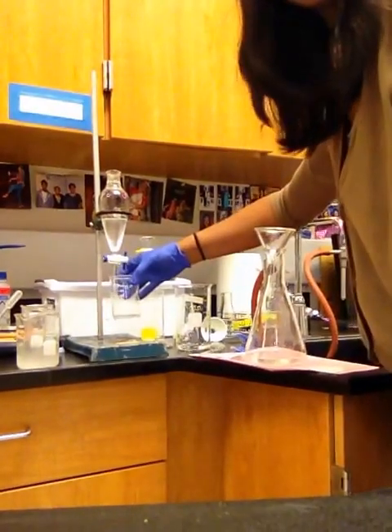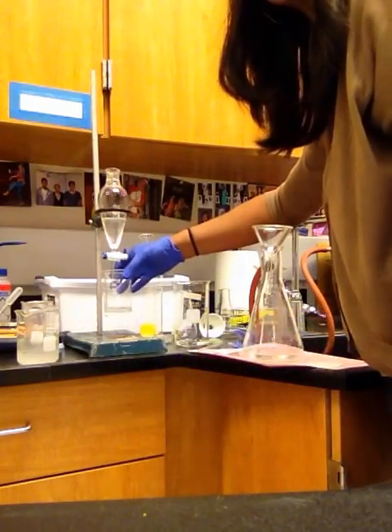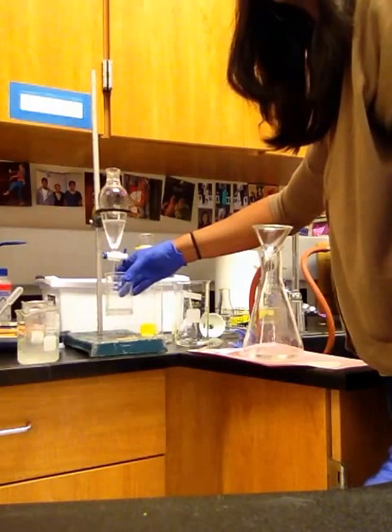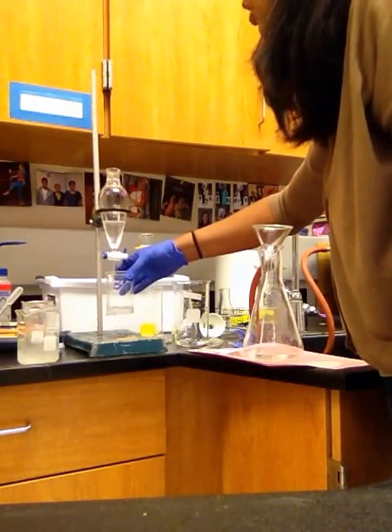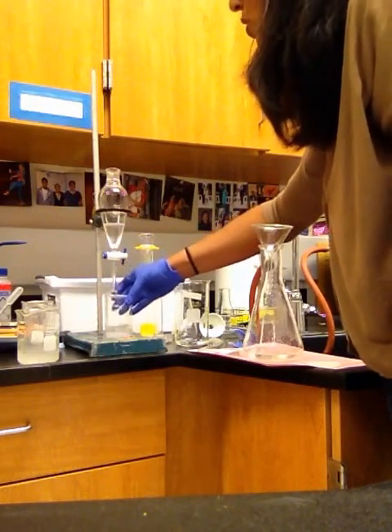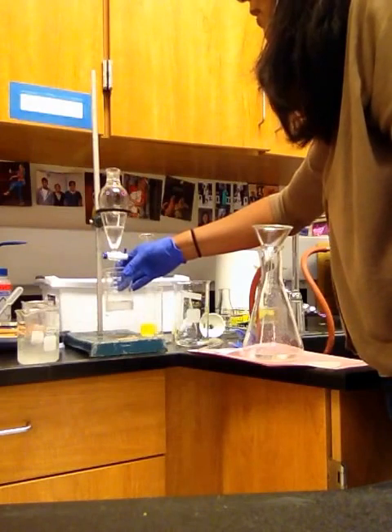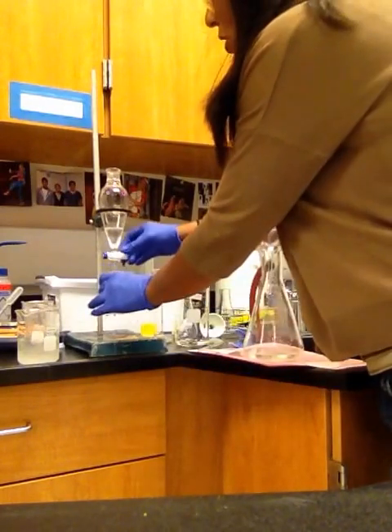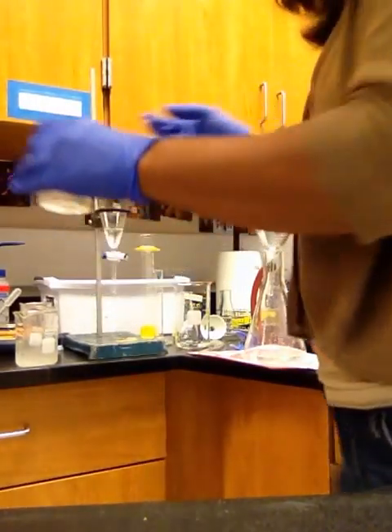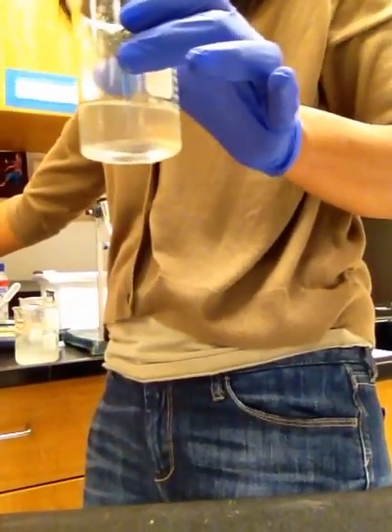You have to dry the organic solvent. So what happens is, as you shake it with NaHCO3 or the aqueous layer, some of the water goes into the organic layer. To dry the organic layer, we use a solid called magnesium sulfate. And I will show you how to do it. I'm not going to wait to get all of it out, but you will get the entire layer out. Then you're going to add a little bit. This beaker does not have to be pre-weighed.